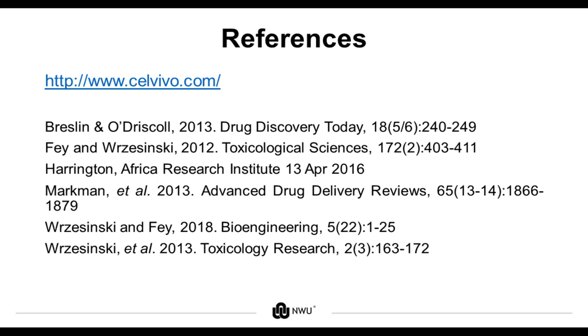So they don't have any supporting matrix or scaffold. But we have another line that my colleague, Dr. Carla Michalis, is working on. She uses a Matrigel-like sodium alginate. I hope that answered the question.